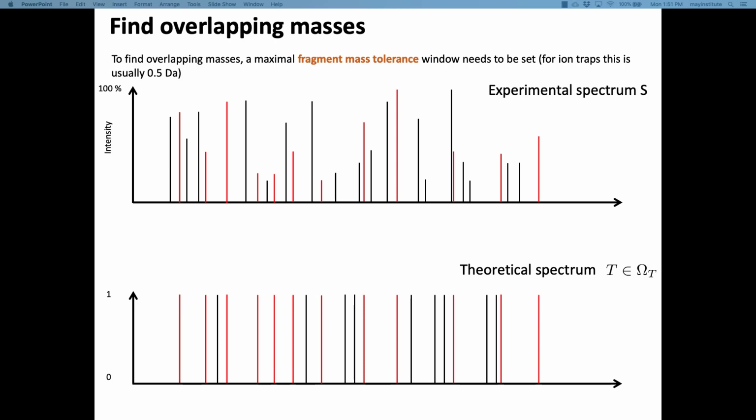The idea is really that you can look at the intense peaks, and if they're shared possibly across multiple spectra, then you just need to browse only these spectra. And in the same way, we can use what's called a shared peak count to score these spectra. Because if they are the same, they should share a larger number of peaks than otherwise. Why would they share peaks otherwise if they're different things?